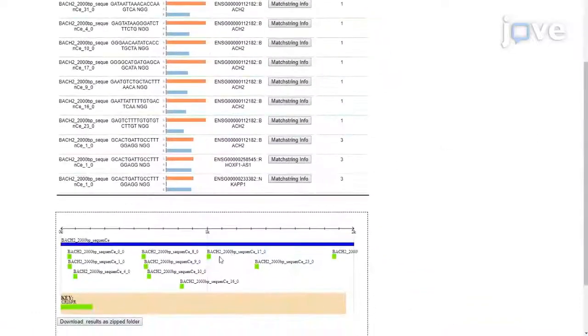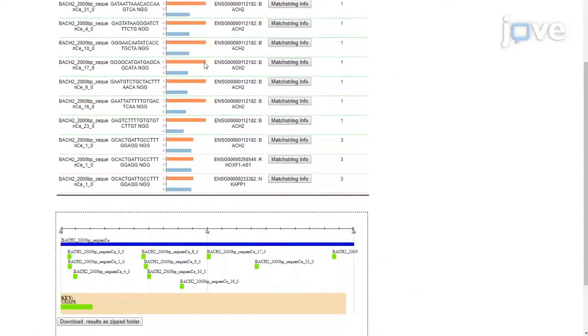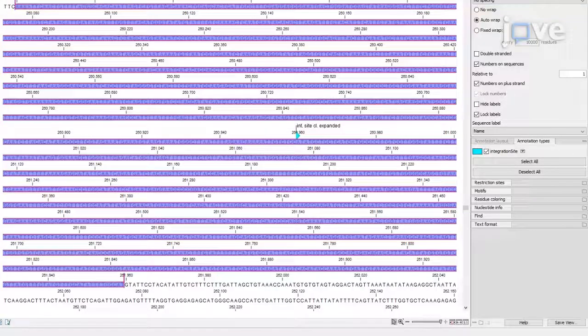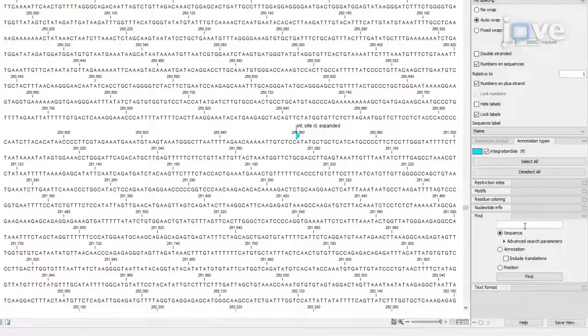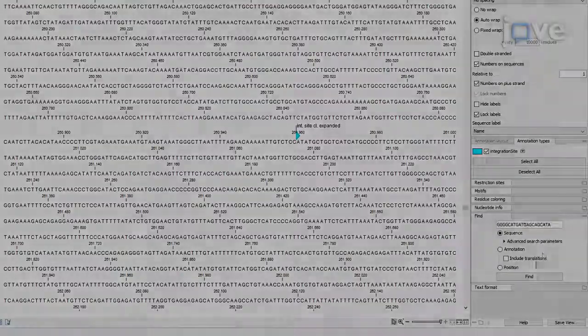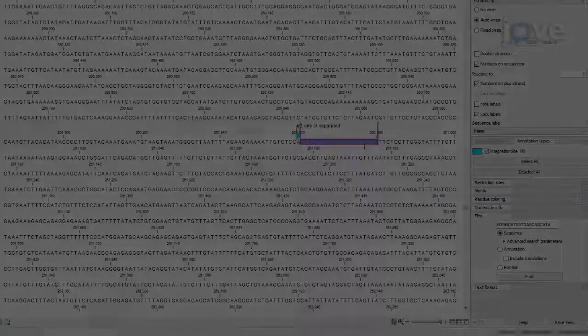From the list with possible guide RNA designs that appears, select a guide RNA with a high score for specificity and efficiency, which is as close as possible to the desired genomic locus to be targeted.